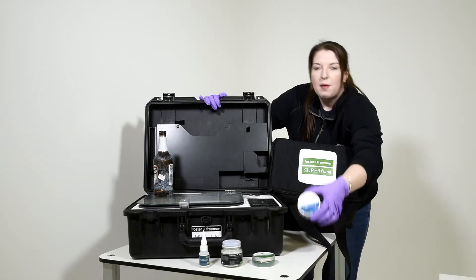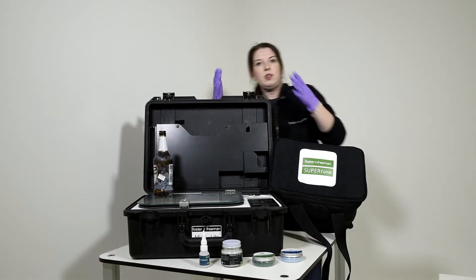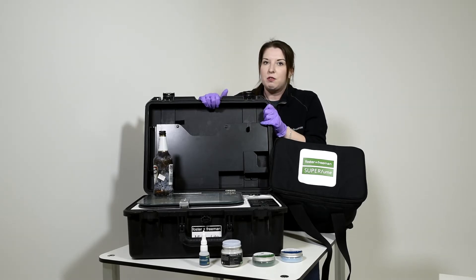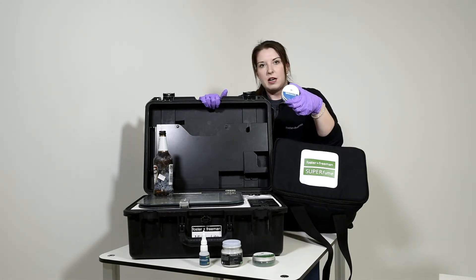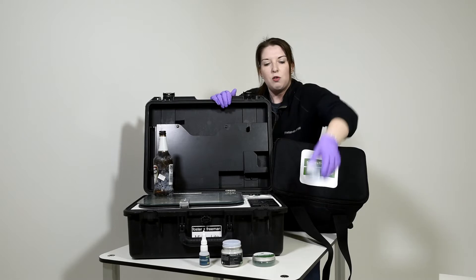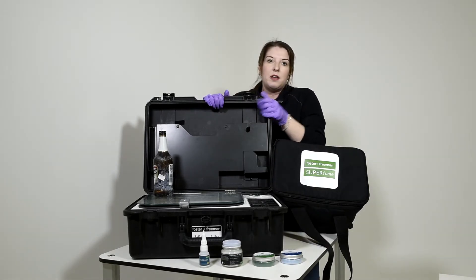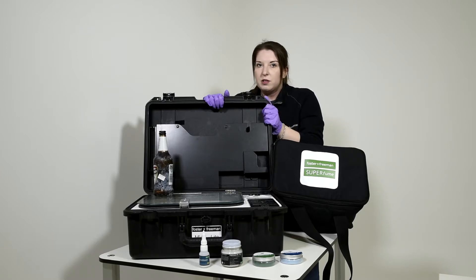We also have our FP Natural Powders. Our FP Natural Powders are powders which work in the infrared — an application known as infrared fluorescence. We can place our powders directly onto our finger marks or over the top of our superglue marks. This might be useful when you have really difficult, particularly patterned or busy backgrounds, because using IR fluorescence, we can help to drop out those backgrounds.